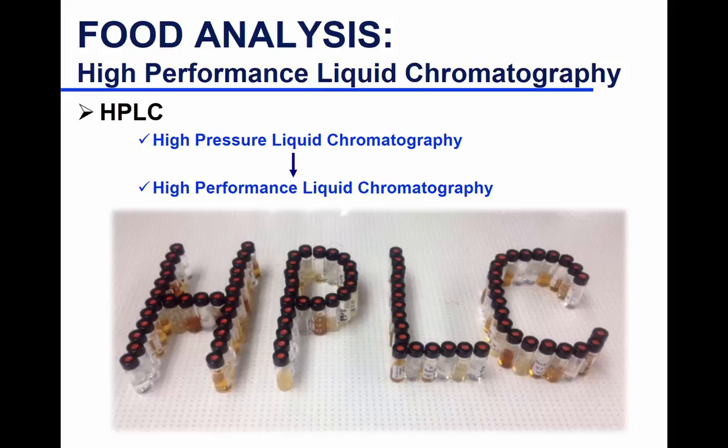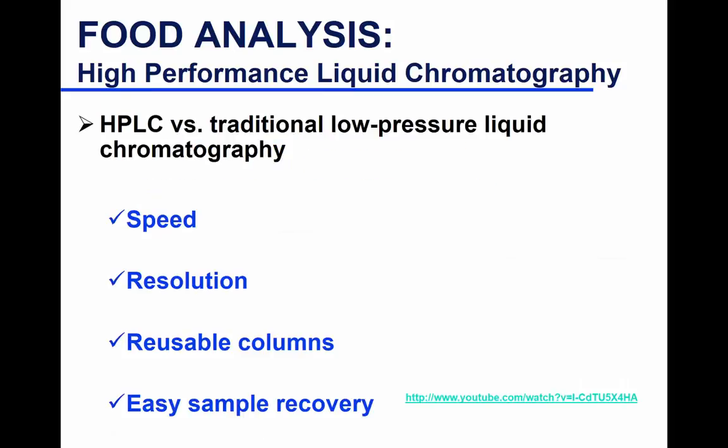But these are your vials. Some of you already prepared the different samples for caffeine analysis. And she was creative that way, so she made them look into HPLC, took a picture, and now I use it.